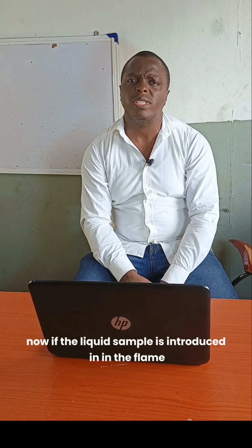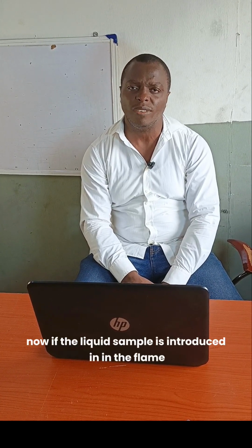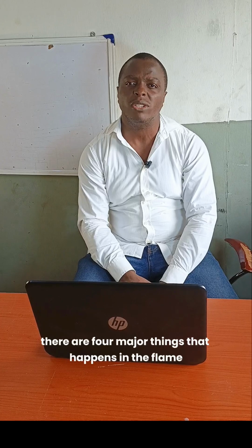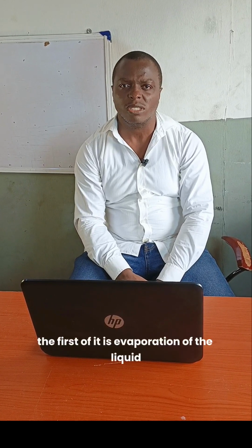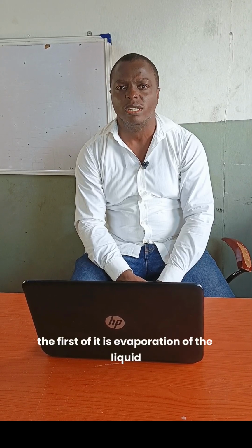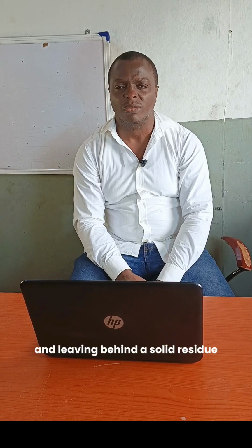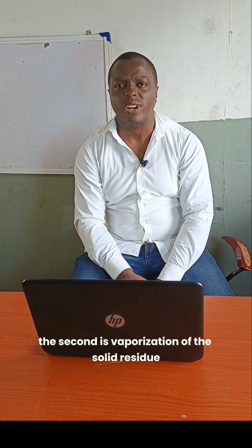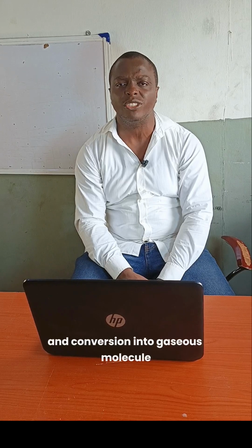Now, if the liquid sample is introduced into the flame, there are four major things that happen in the flame. The first is evaporation of the liquid, leaving behind a solid residue. The second is vaporization of the solid residue and conversion into gaseous molecules.